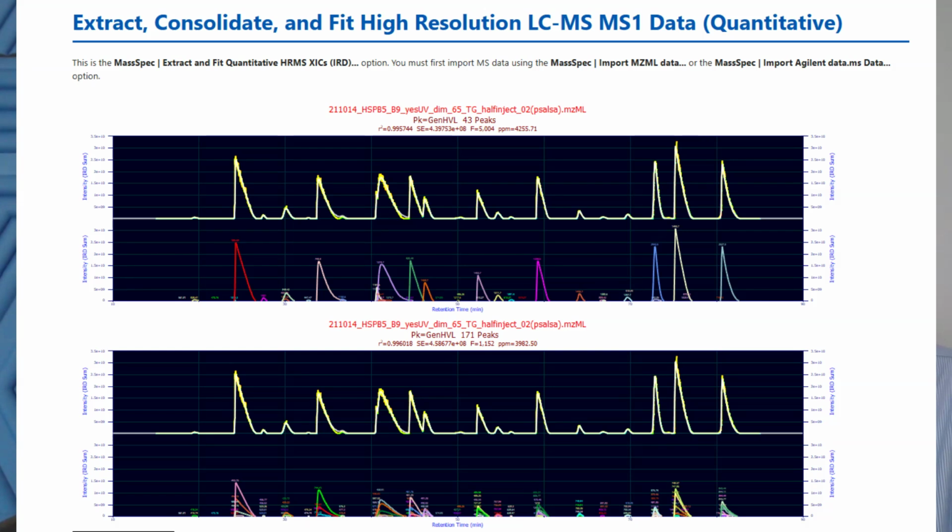So I won't get into how we do that. It's complicated. You're pulling out each of the individual raw strands of the XICs. You're modeling each of those, and you're aggregating them. It's a fairly complicated kind of process, but it works and it works well. And when you get into the current technologies, you pretty much have to look at that second dimension. And when you get into that second dimension, it gets really exciting and interesting, because you're doing things that have not been considered until this present decade of science. So you're really doing things that haven't been done before. You asked about 2 peaks that are right on top of each other in the chromatography.